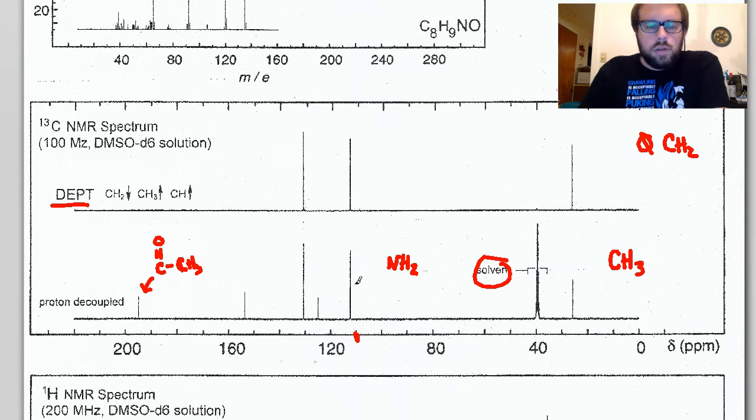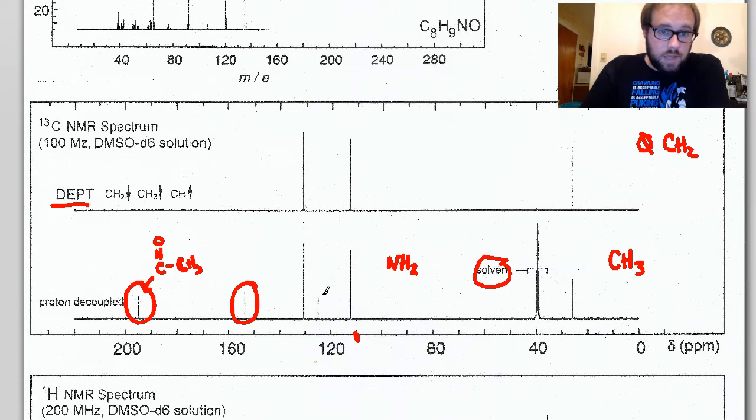So when you take a look here, okay, you've got 4 unique carbons in the aromatic region. So that would suggest that it's a di-substituted ring, and the di-substitution pattern is probably going to be para because 2 of these quaternary groups disappear, and that just leaves 2 identical sets of carbons. And you notice the ketone also disappears. That is not present on the DEPT. So for those that are confused what I'm talking about, this one right here, this one right here, which is the ketone, and this one right here. They are not present in the DEPT.